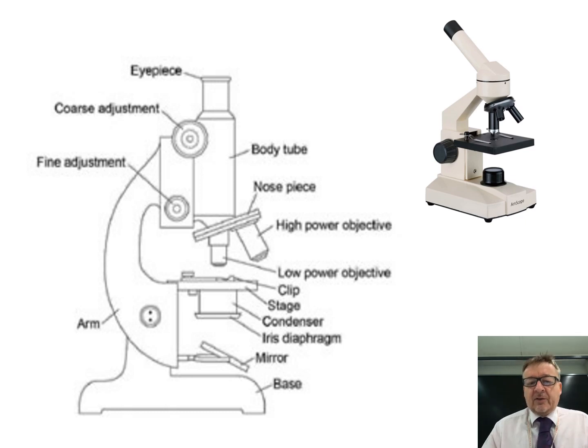Starting with the microscope itself - in the top right-hand corner, that's what a typical class microscope looks like. There are a few labels we need to know about.